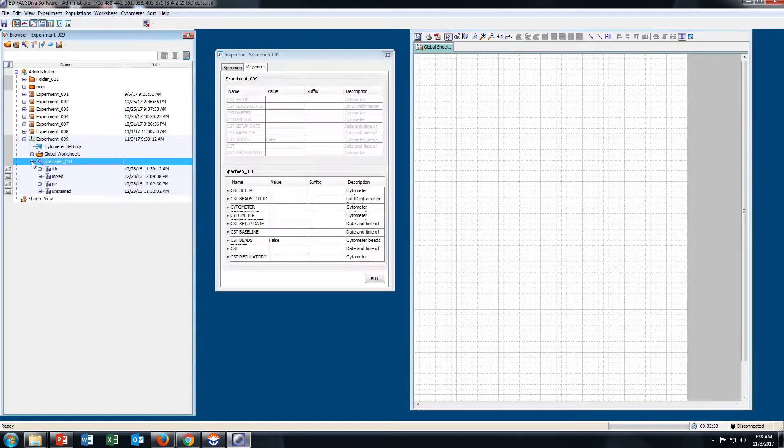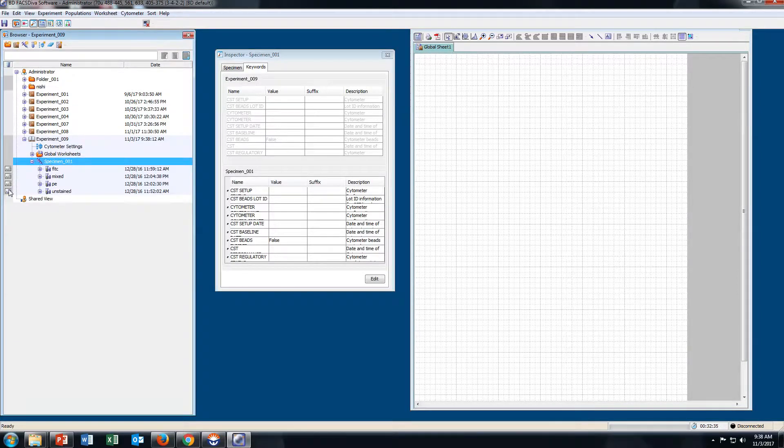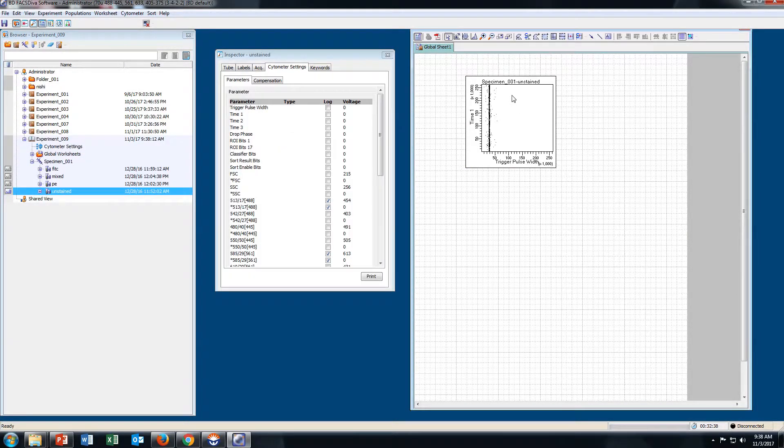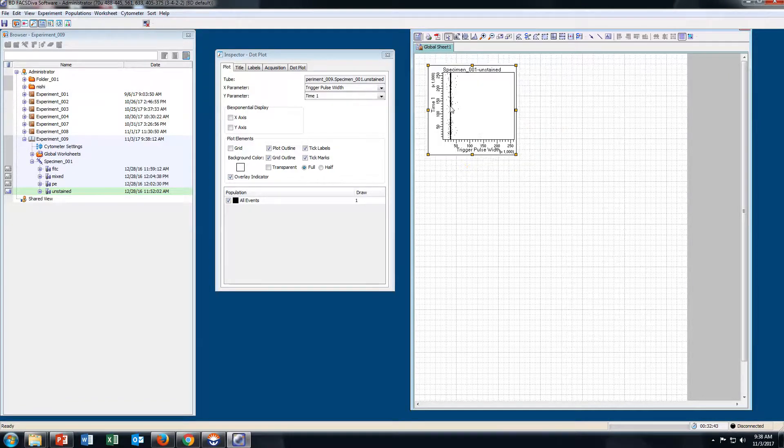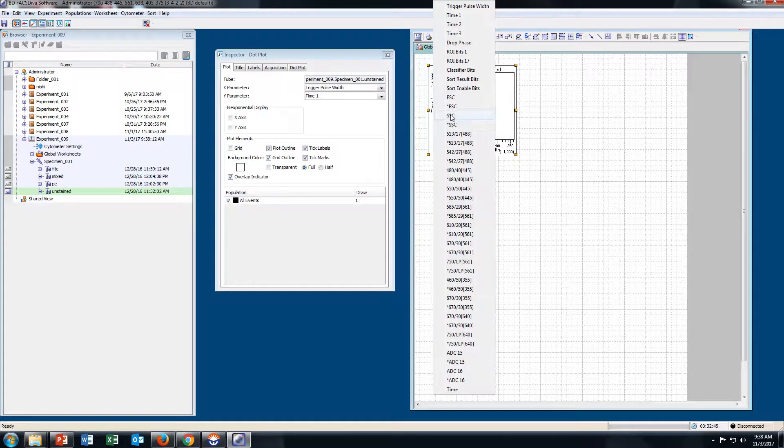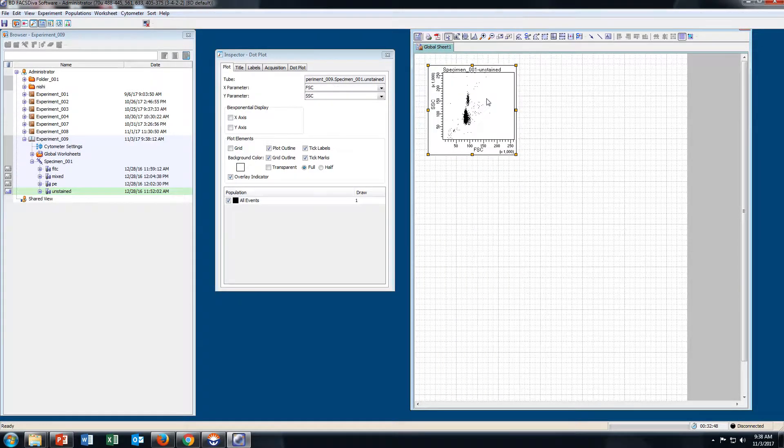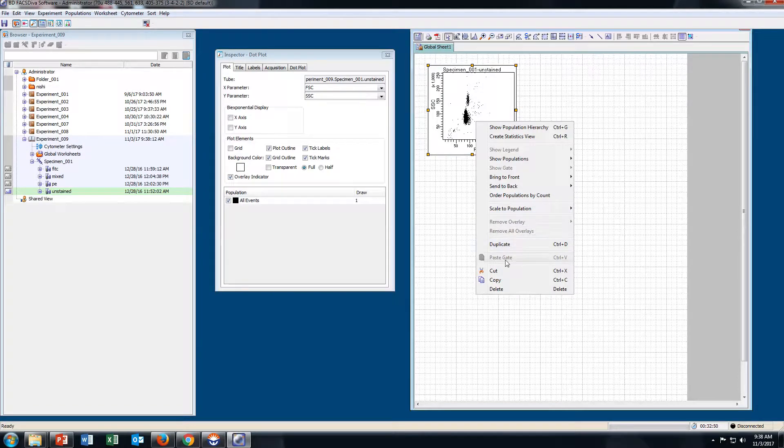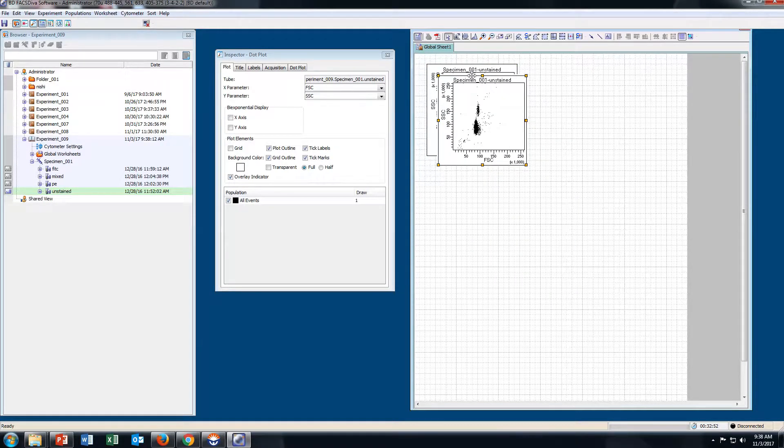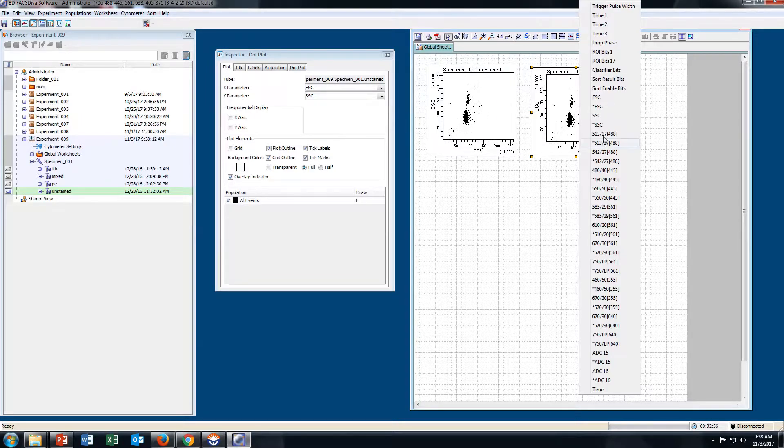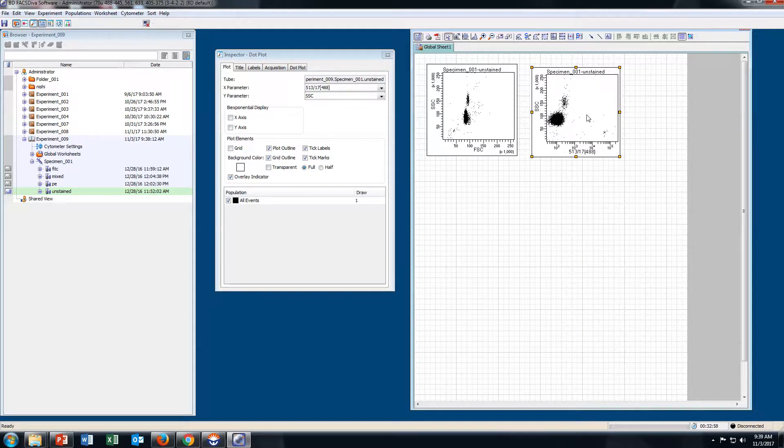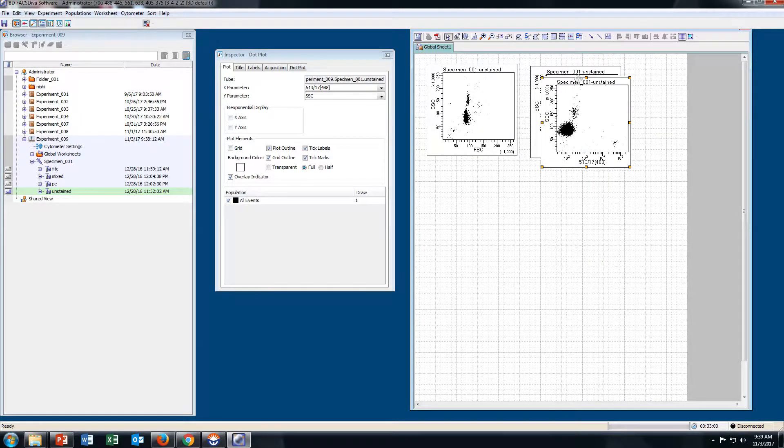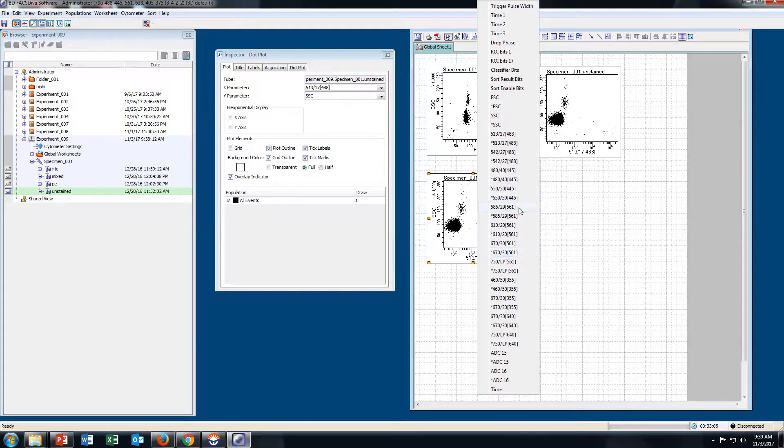Click on Specimen, then click on Unstained Tube. Now plot your graphs: SSC, FSC. Duplicate this plot. Here I will take SSC versus GFP and SSC versus PE.